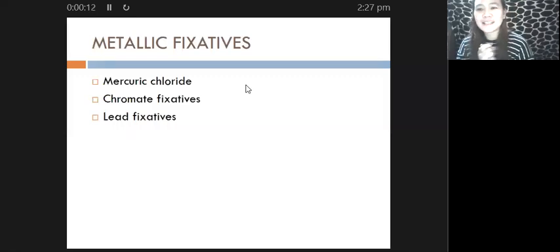Okay, hello class. So this is the last video that I will be providing you. And for this video, we will be discussing the other fixatives which are utilized in the histopathology laboratory. In addition to the aldehyde formulations that we have discussed before.